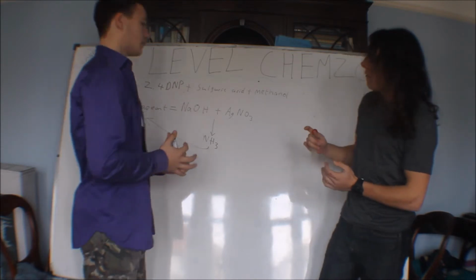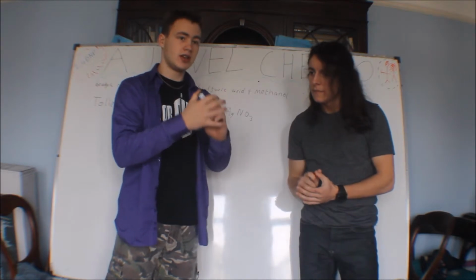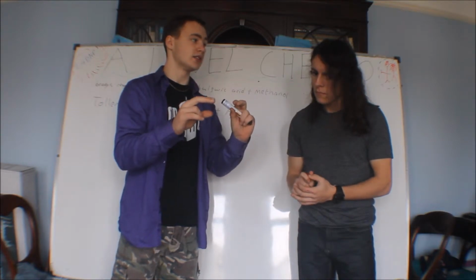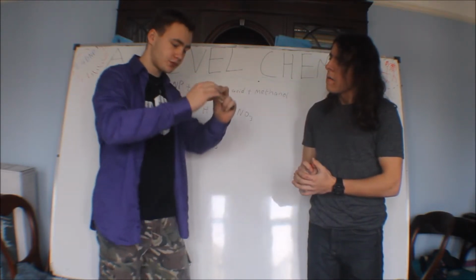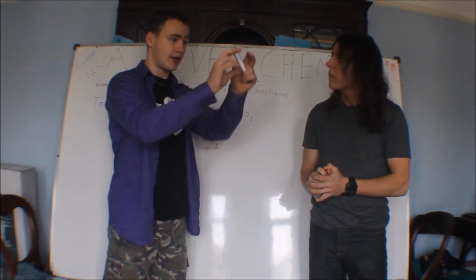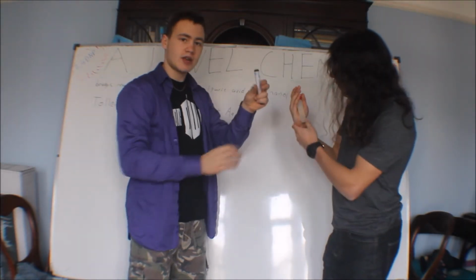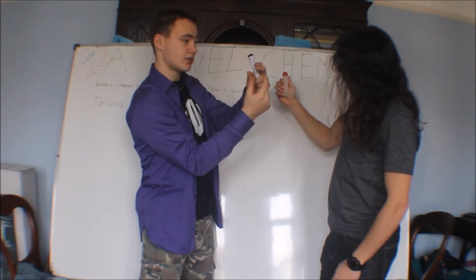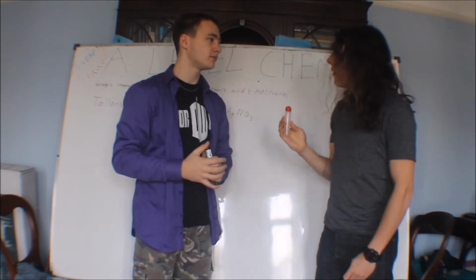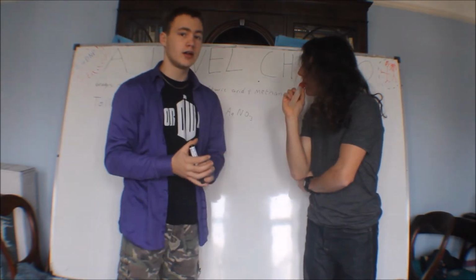So what does it do then? Well, because it distinguishes between the aldehyde and ketone, what it does is oxidise an aldehyde into a carboxylic acid. So what will happen is the silver in this will form an actual silver mirror around the edge of the test tube. If we put this in a test tube, add Tollens' reagent, if it's an aldehyde, what's in it gets oxidised and the outside will become a silver mirror. If it's a ketone, it doesn't do anything. That's a shame. But it's helpful. If you do this first and then this, we'll know it's a ketone if it doesn't do anything.